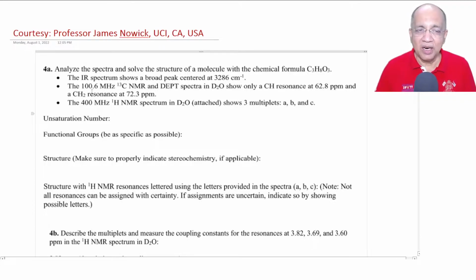And 100.6 megahertz C13 NMR and DEPT spectra in D2O show only one CH resonance at 62.8 ppm and one CH2 resonance at 72.3 ppm.